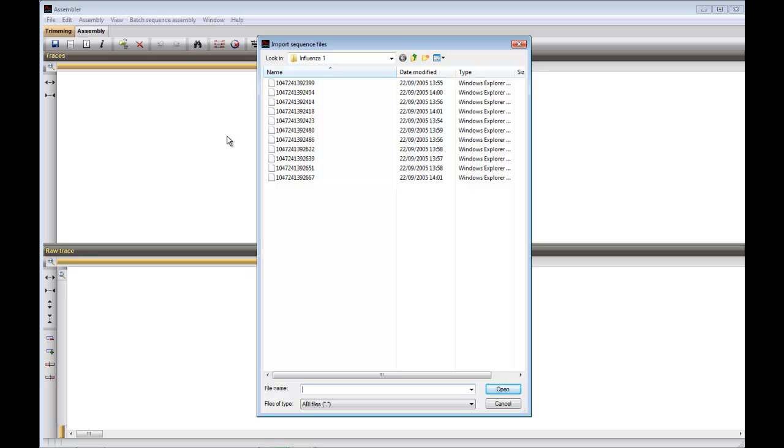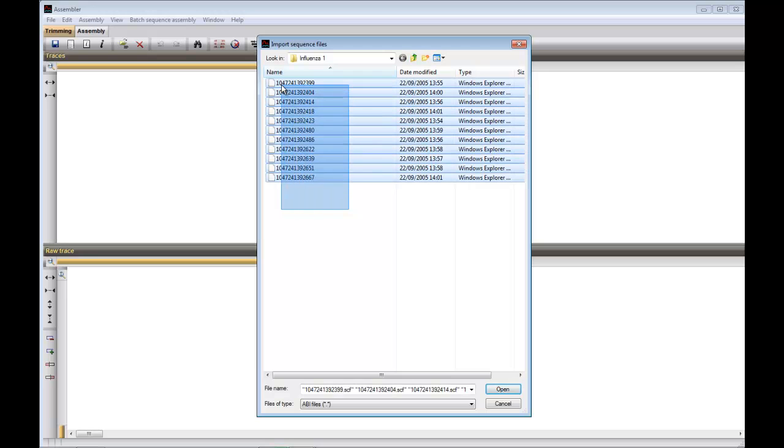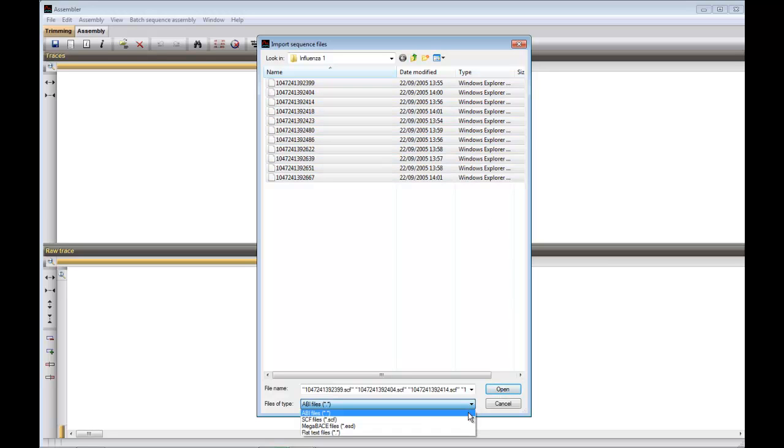We will import raw chromatogram files from an automated sequencer. Select the sequences and adjust for the correct file format, then click Open.